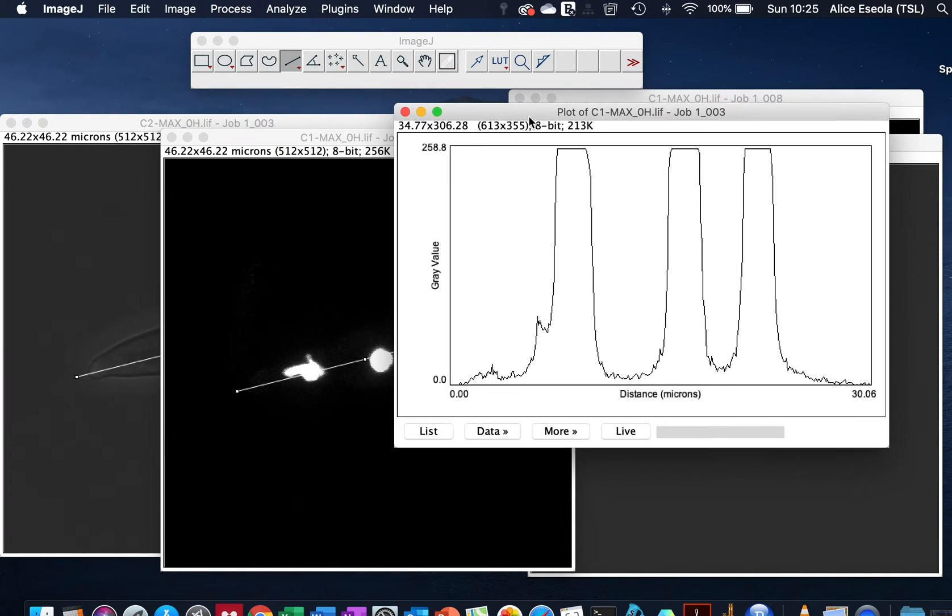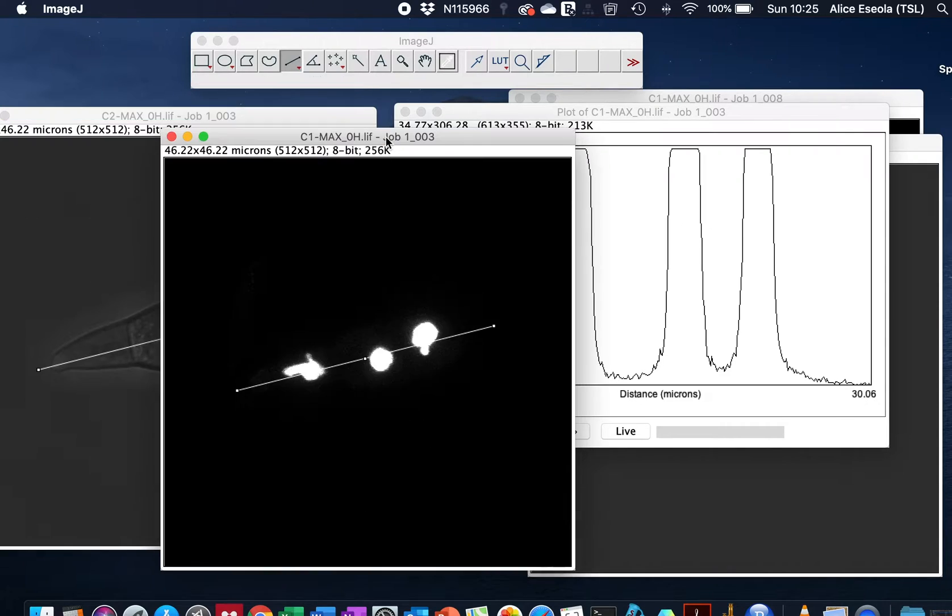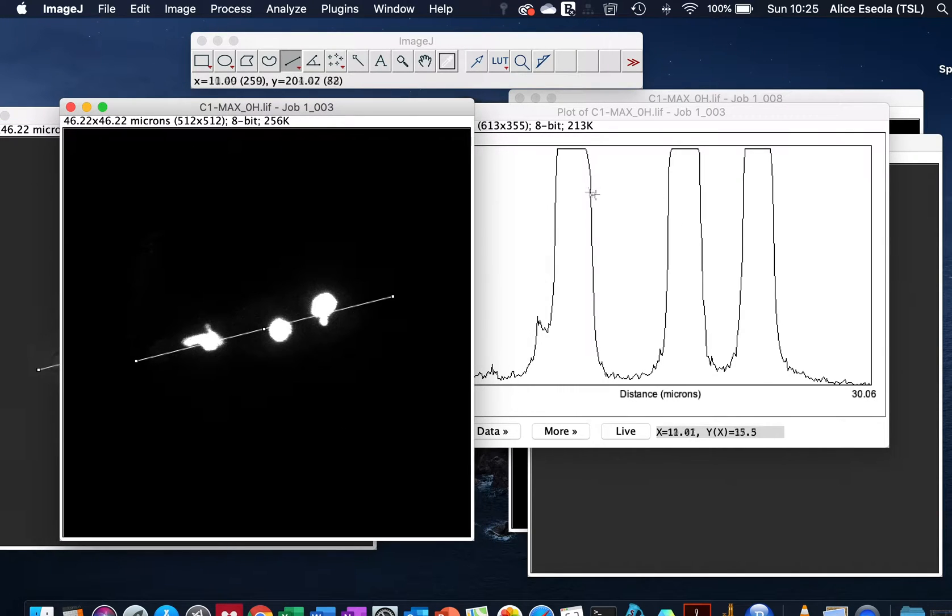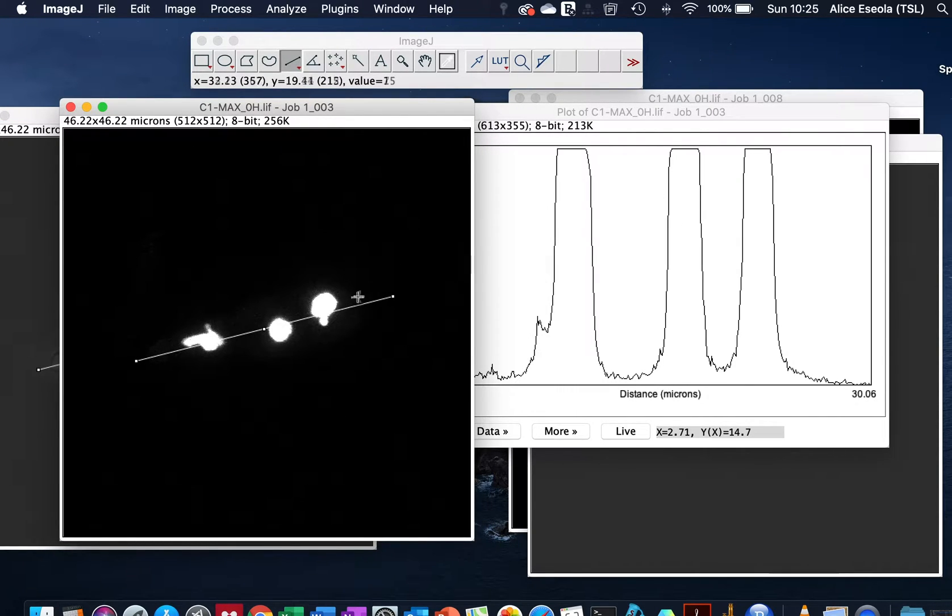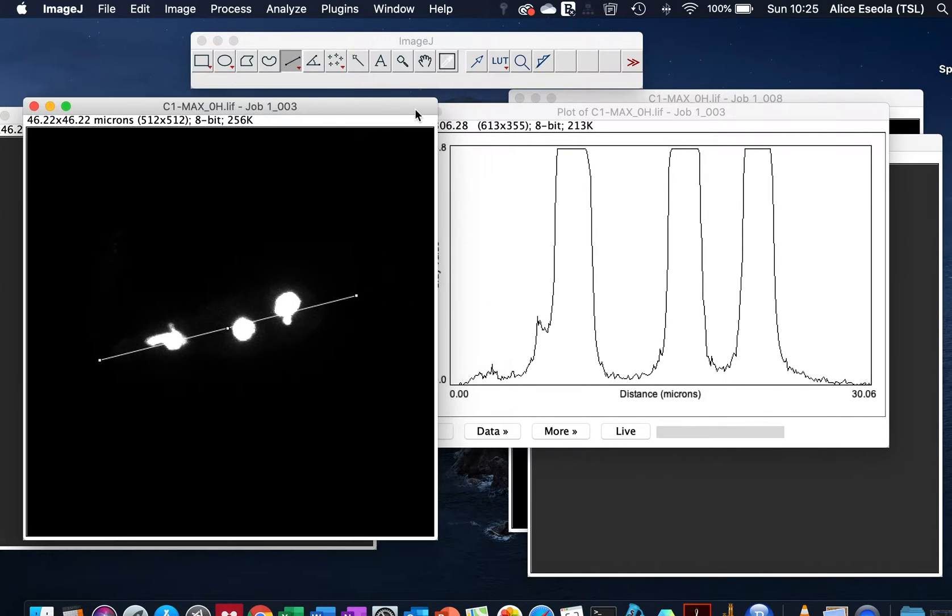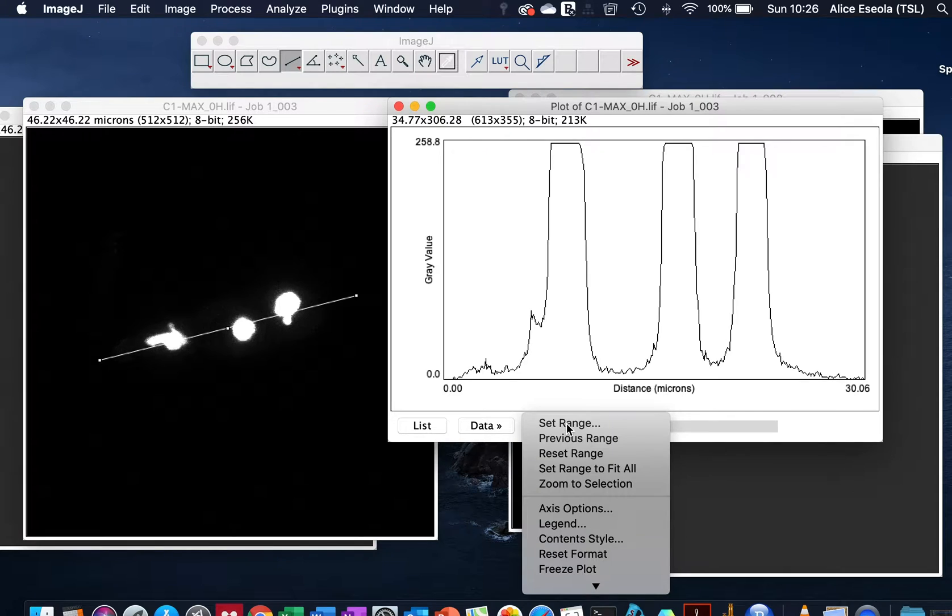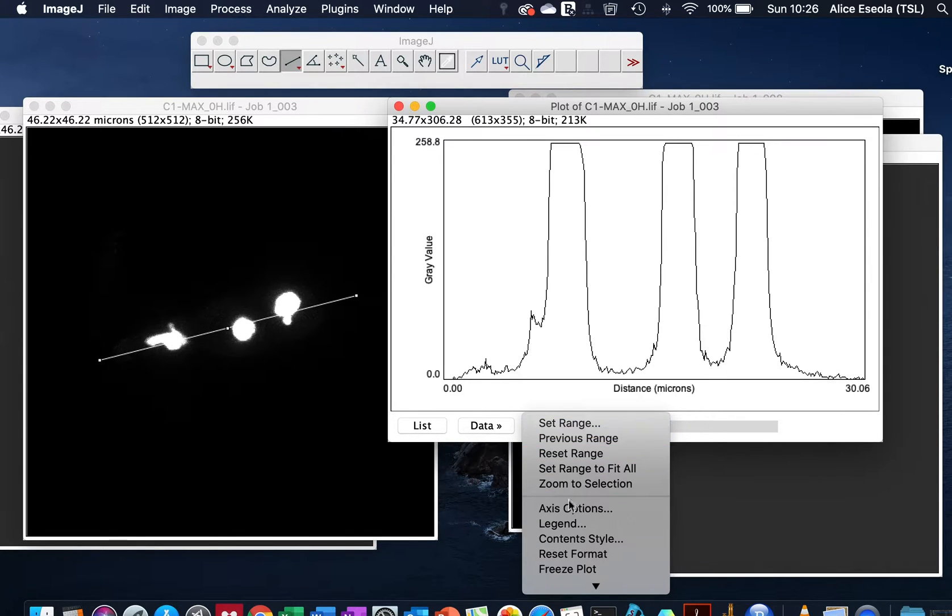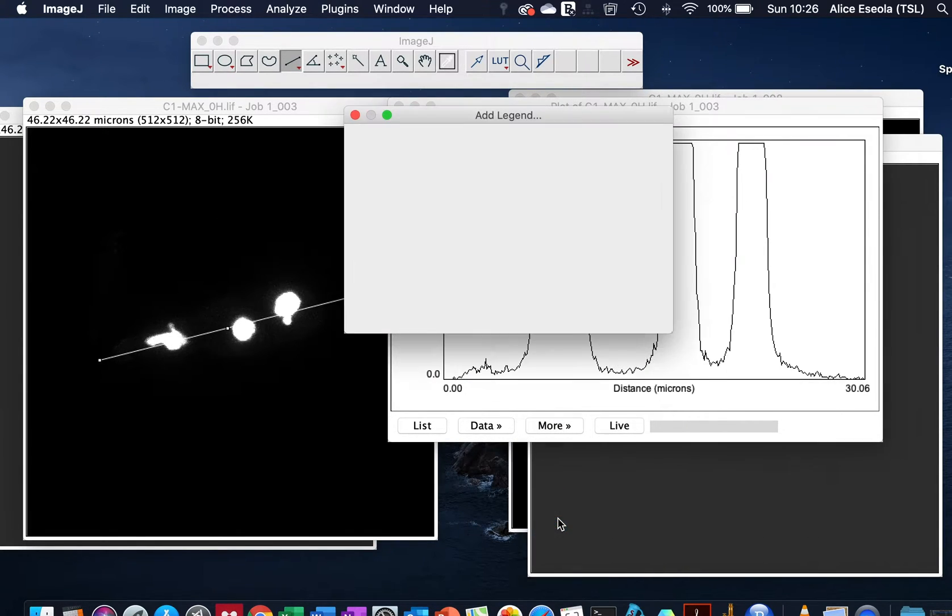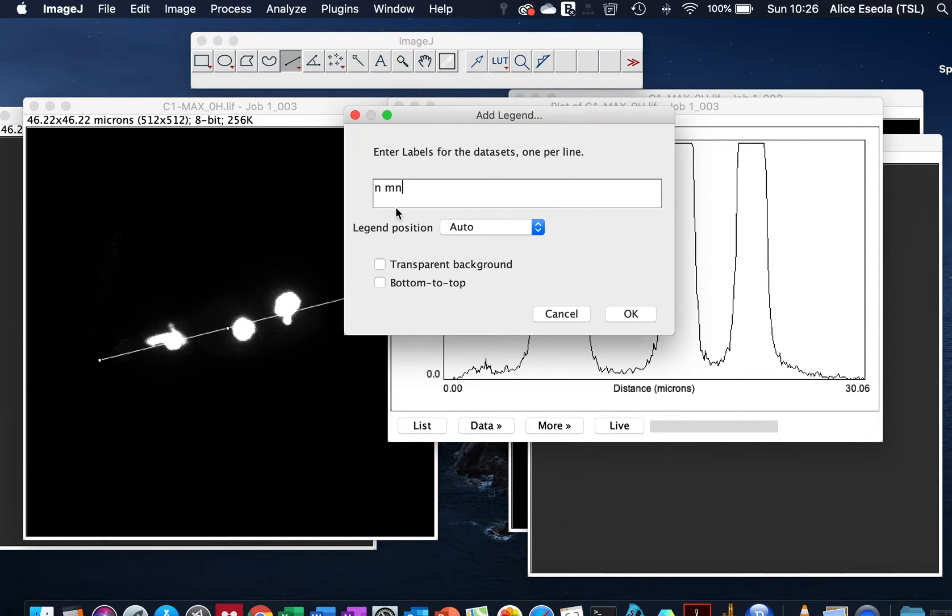And here we can see each of these peaks on the graph corresponding to the fluorescence intensity in our sample. We go to Data, More, Legend, so you can give it a title that you want.